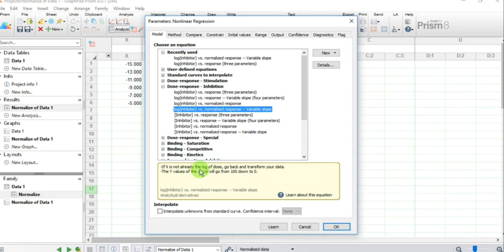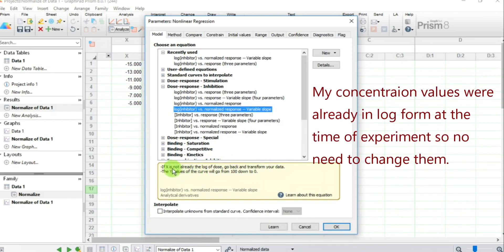A dialog box opens which says: if X is not already the log of dose, go back and transform your data. My X values are already in the form of log doses or log concentrations, so I'm good to go.